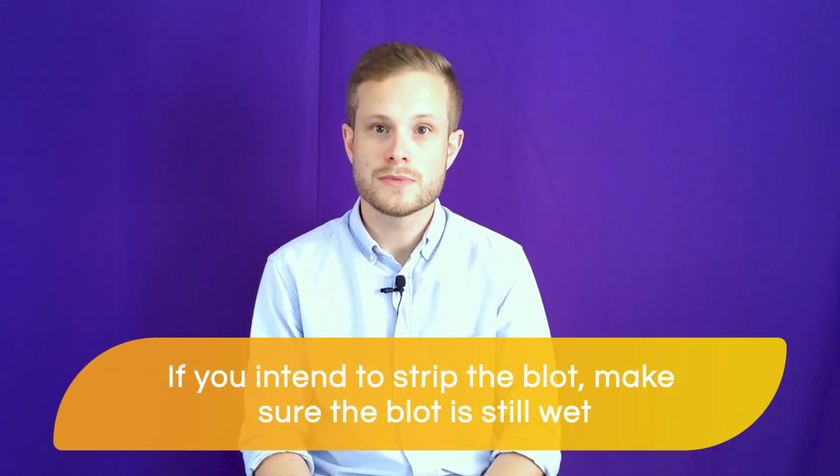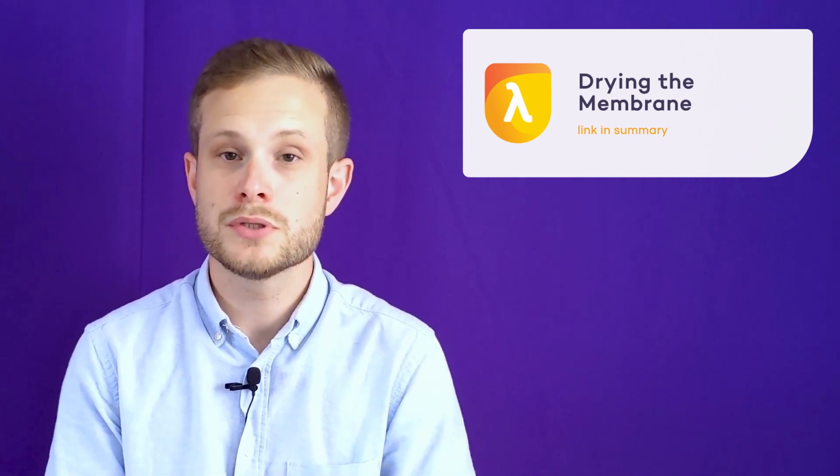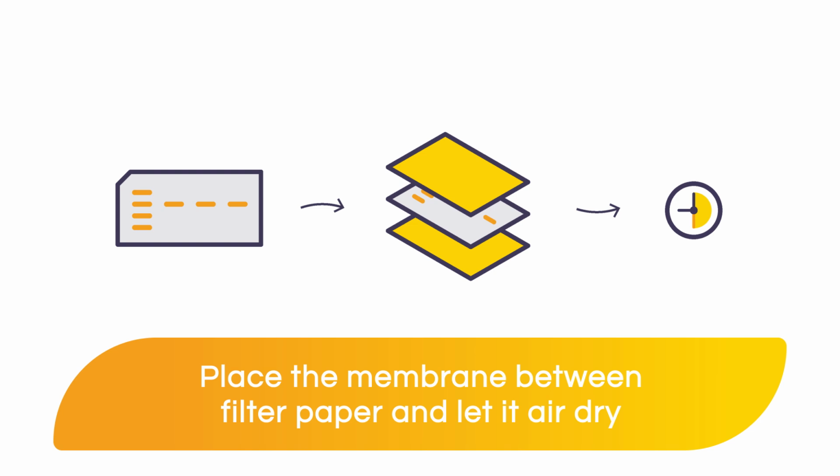If you do intend to strip the blot, make sure to do this while the blot is still wet. You can then dry it out and store it to be reprobed later. We talked about how to dry your blots in the earlier course, Drying the Membrane. There's a lot of useful information to be found in that course, but as a reminder of the basics, you can simply place your membrane between two pieces of filter paper and let it air dry for about 40 minutes to 1 hour, or longer if you want to pause your protocol.